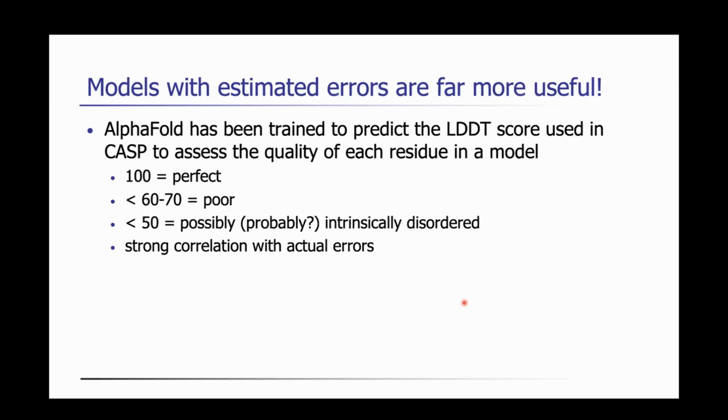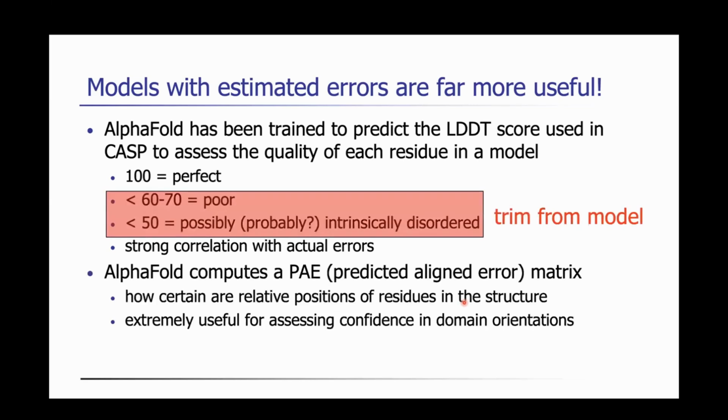Right. Okay, so I'll go through this really quickly because Tom gave a really good explanation of all of this stuff about AlphaFold. I've always thought that it's just as important to know how confident you can be in your model as to have a good model. The pLDDT score and the PAE matrix make these models much more useful. That's all being covered.